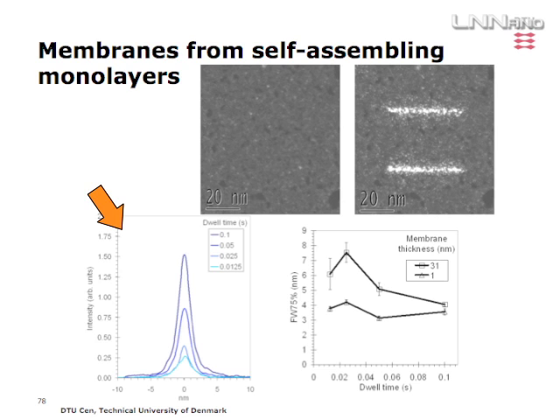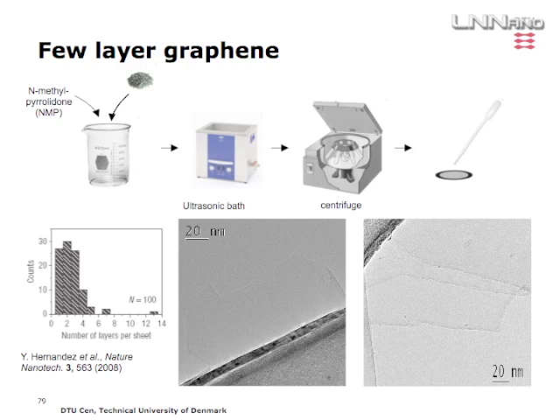So you can see the longer you have your beam in a given position, the higher the signal, so the larger the dot. There's also a function of the thickness of the substrate that you're writing on. This is a 1 nanometer thick substrate and a 31 nanometer thick substrate. And you can see you get almost twice the full width at 75% maximum. So obviously, looking at this, going to thinner substrate is better.